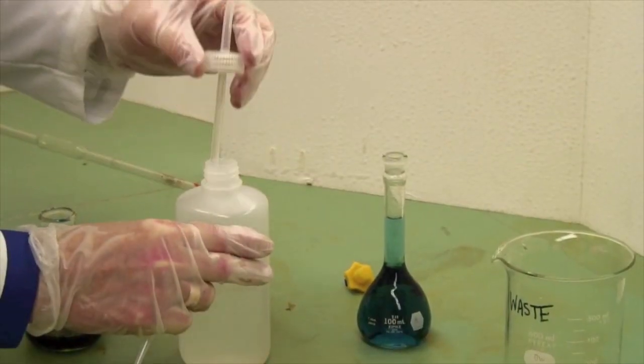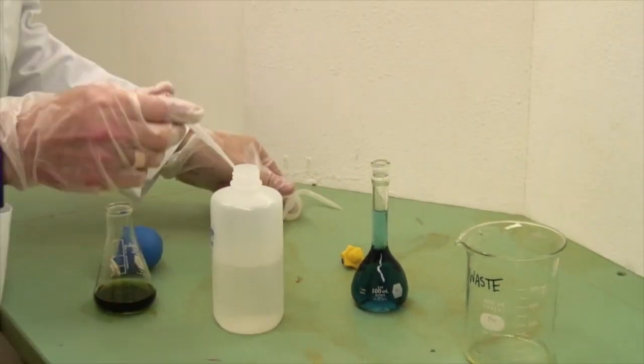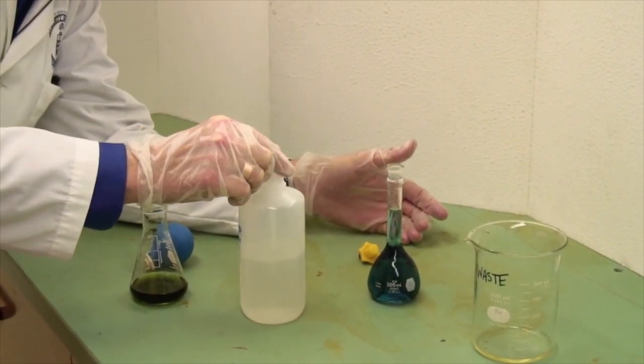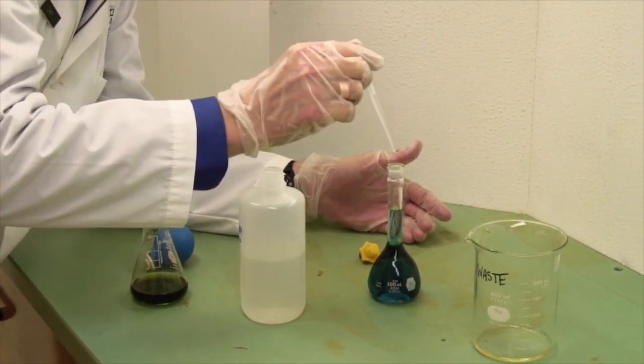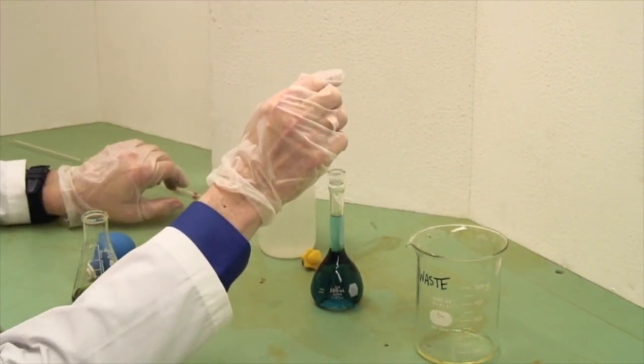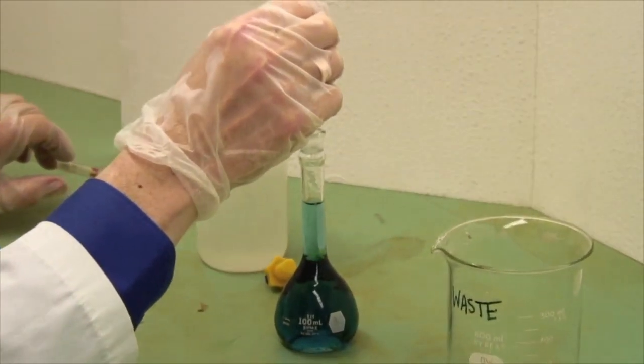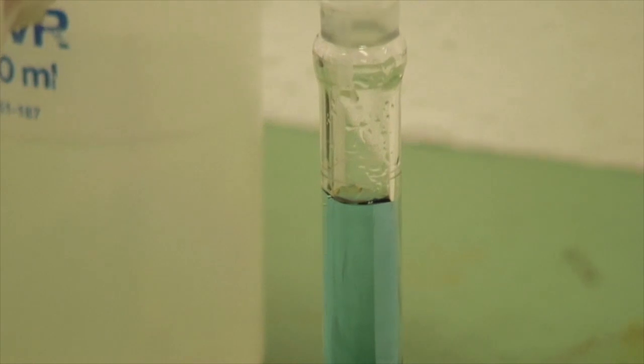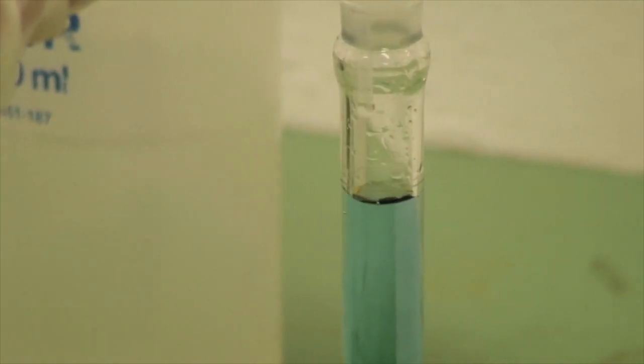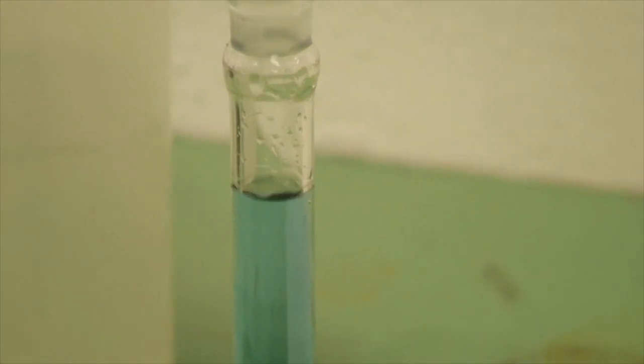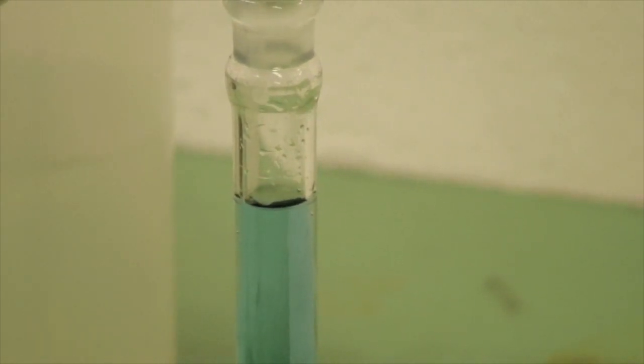Now that we're almost at the top, instead of using the squeeze bottle, which is not actually all that easy to control, use a dropper. And I'm going to get my head down so that I'm seeing the line of the volumetric calibration rather than as a circle. Do this at eye level. Add it drop-wise until the bottom of the meniscus is tangential to the line.